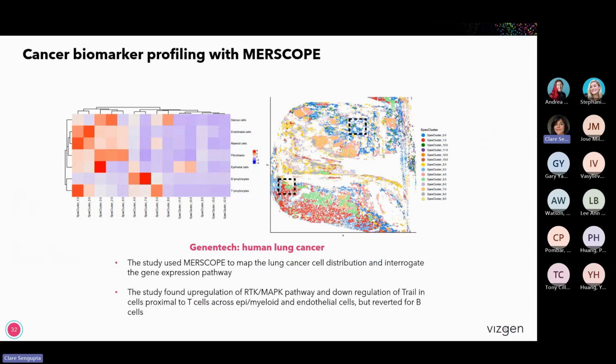So this is an interesting piece of research, and I wanted to highlight it because this is part of a larger effort to generate a spatial tool called the Spatial Expression Explorer, which is a comprehensive analysis software and web-based application. So this MERFISH data was used to demonstrate the utility of this tool and demonstrate the colocalization score method that they're developing with this tool.